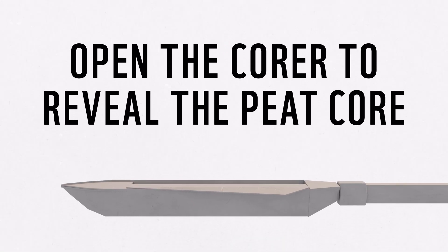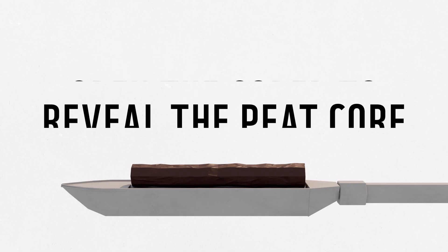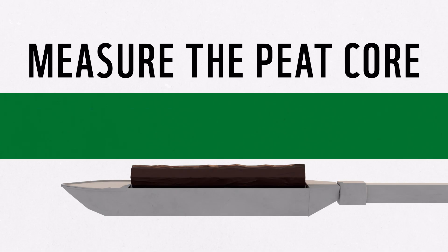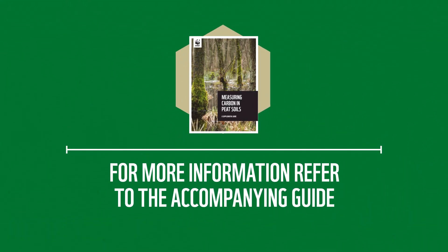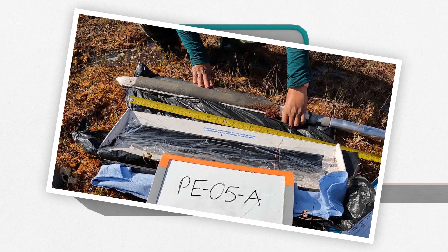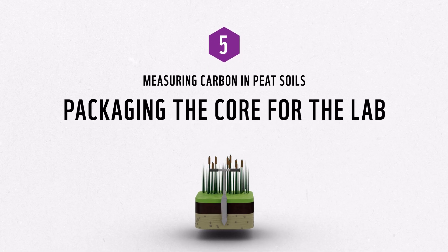Open the corer and reveal the core sample. Measure the length of the corer and make notes of any distinct changes in soil profile in your notebook — examples can be found in the accompanying guide. Mark the site and corer ID on the whiteboard and take photos of the corer from above so that the entire corer profile and the whiteboard is in frame. Once you have taken measurements, notes, and photos, you can package the corer for further lab analysis.